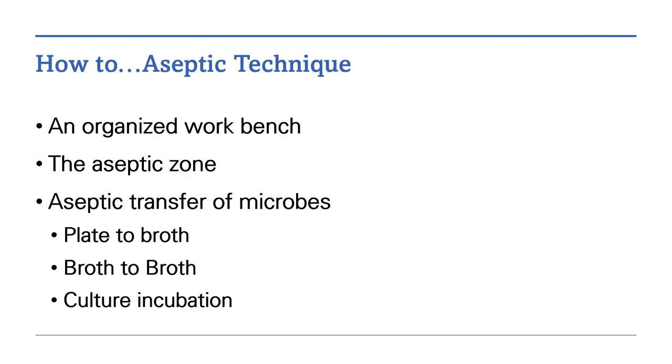How to Aseptic Technique. In this series of videos, you will learn how to organize a workbench, how to create an aseptic zone, and then have demonstrated aseptic transfer techniques — including transfer from a plate to a broth, a broth to a broth, and then we will view culture incubation.